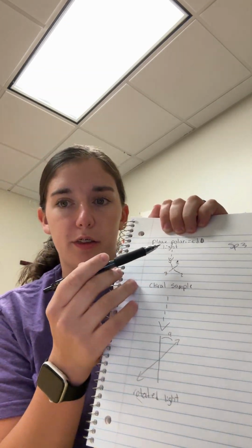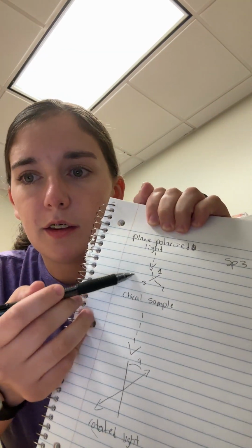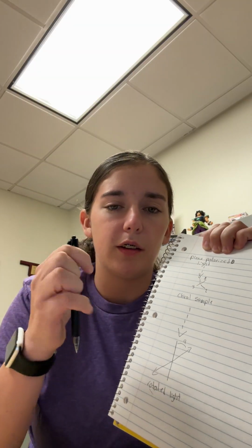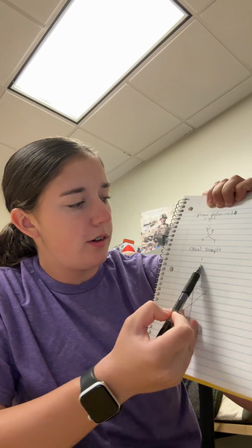So when the plane polarized light passes through the solution, so let's say this is the solution, the light can be rotated either clockwise or counterclockwise depending on the configuration.